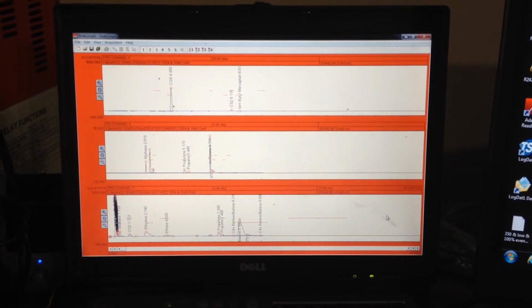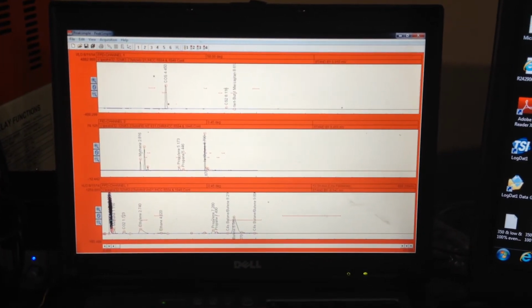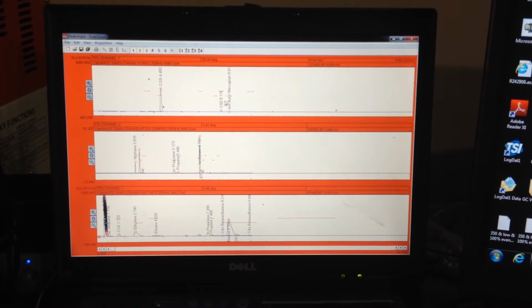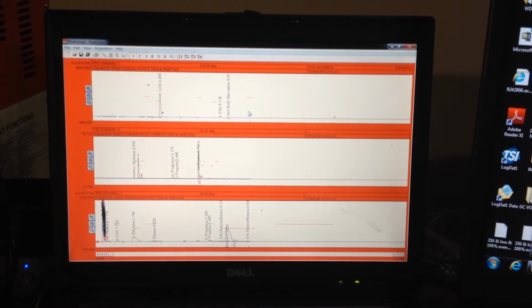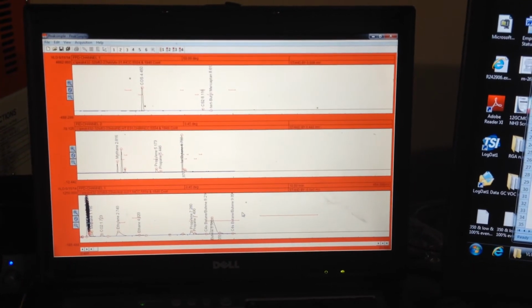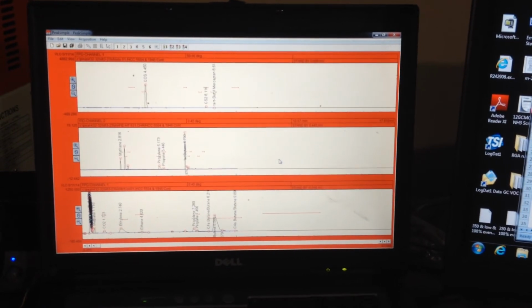So we will only need to do that one time because these are very consistent in the hydrocarbons, much more so than they are up here. So we'll have a second run of sulfur and we'll have a first full run of the hydrocarbons to compare after the second run.